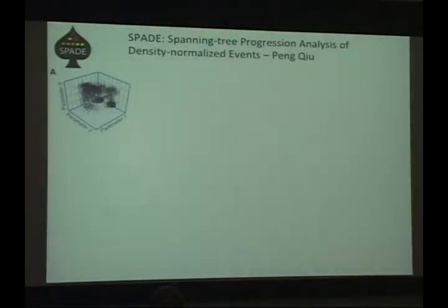This was developed primarily by Peng Qiu in Sylvia Plevritis' lab, but we've obviously taken it and applied it to the CyTOF data with a lot of success. I'm just going to talk to you very briefly about what SPADE is. Again, you're going to have a whole lecture on this, and some of you may already have some sense, but just so that you can interpret the data I'm about to show you.